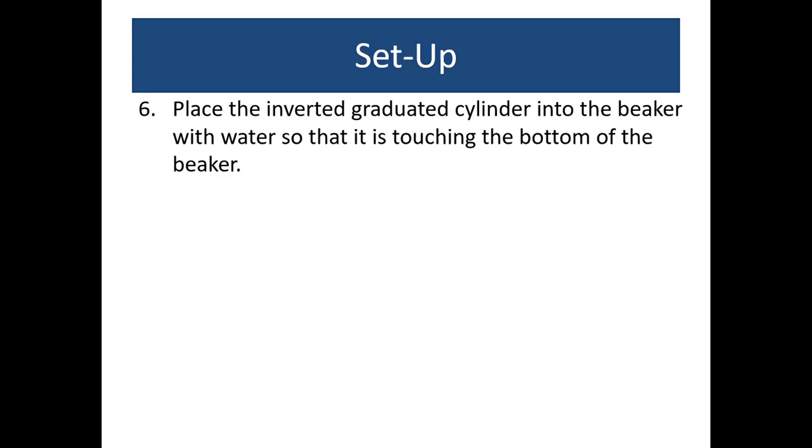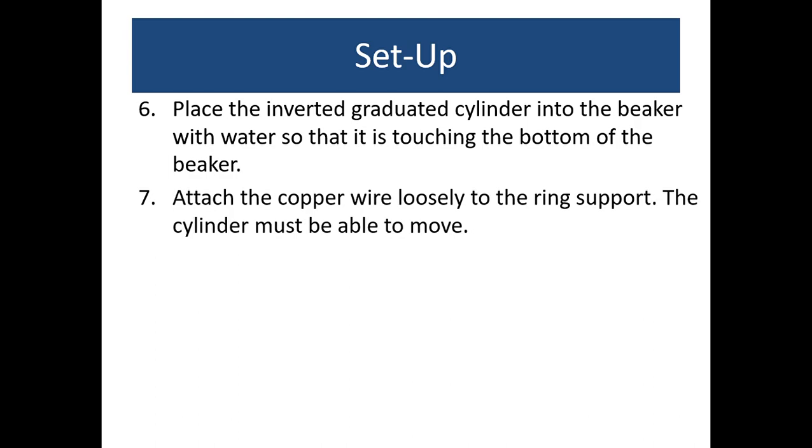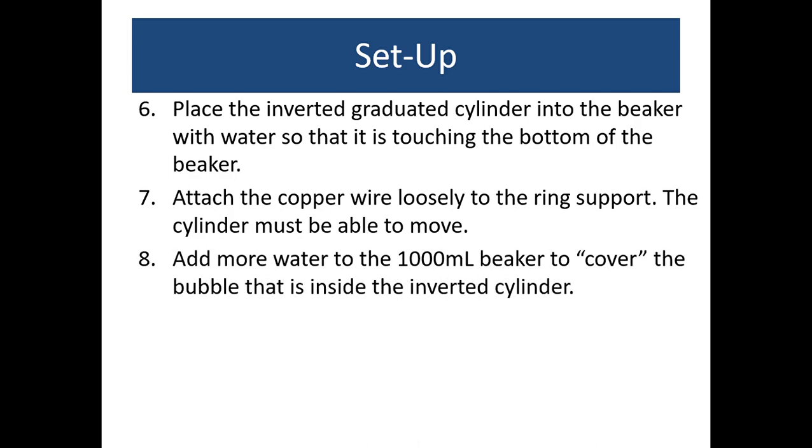Now what you'll do is very carefully place the inverted graduate cylinder into the beaker. Don't release your thumb hold until the cylinder is submerged so the air bubble remains in there and place it so that it is touching the bottom of the beaker. Now with the copper wire you looped on it, you can attach it to a ring support so that the cylinder is slightly suspended but submerged in the water while still being able to be slid up and down. You may have to add more water to the beaker in order to cover the bubble that is inside the inverted cylinder.